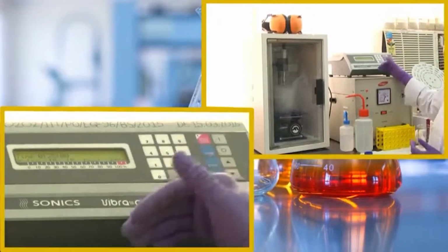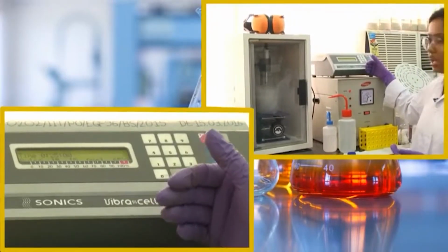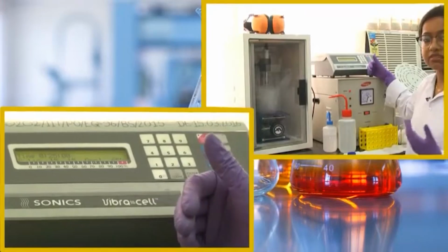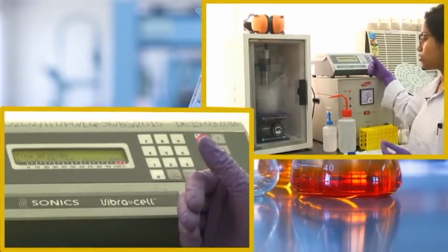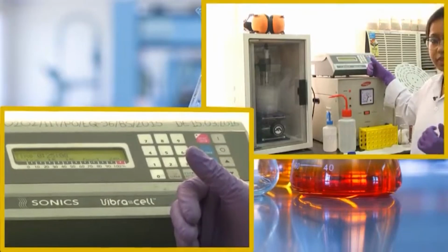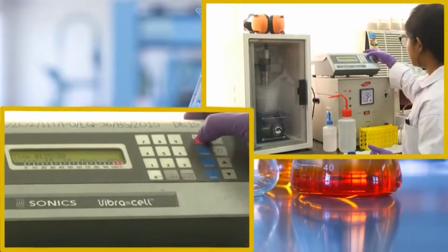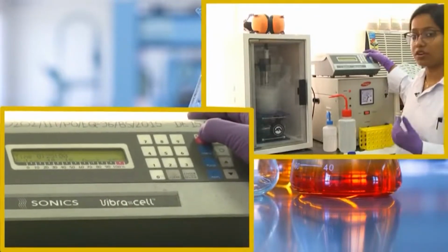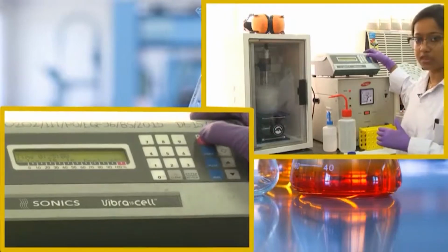The timing and the pulse will depend on what kind of tissue or cells you are using, and the best way to judge is that your solution becomes liquidy again, the viscosity will decrease, and the solution will turn into a pale yellow color. So, it will change a little bit in color. It is a trial and error method. You go for it, and if you are not comfortable or happy with it, you can change the methods or the protocols here.